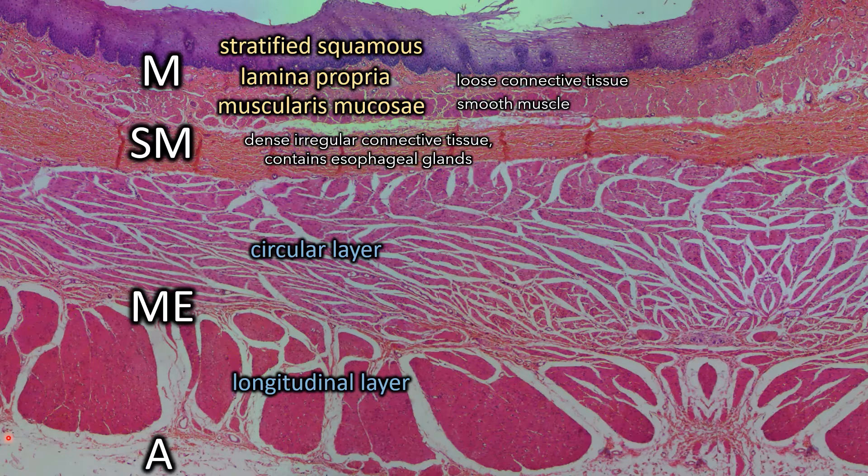One more note about the muscularis externa: depending on where you are in the esophagus is going to determine what muscle fibers you're seeing. If you're looking at the superior portion, you're going to see skeletal muscle. The middle is going to be a mix, and the most inferior portion will be entirely smooth muscle. So that is how I know that I'm looking at an inferior section because this is smooth muscle. And once you see what the skeletal muscle looks like in cross-section, you'll understand how easy it is to tell them apart.